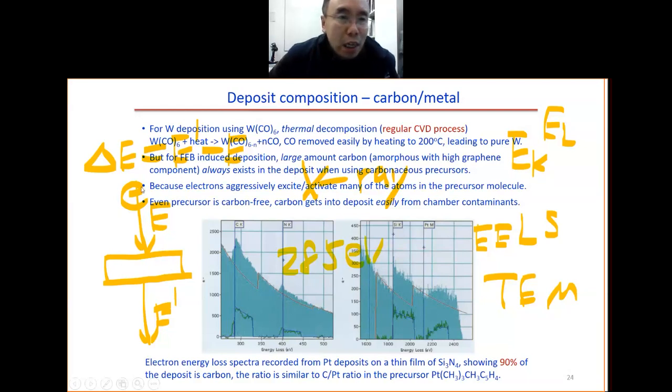This energy here is 200 keV, for instance. Coming here, it will be 200,000 minus 285, so it only loses part of the energy. But for the case of X-ray, the entire X-ray photon is absorbed, because we cannot absorb half of an X-ray photon.